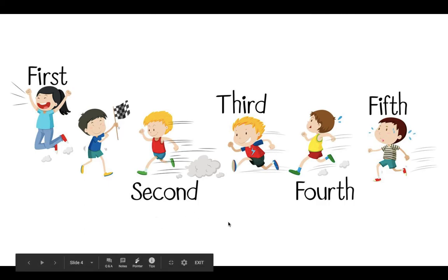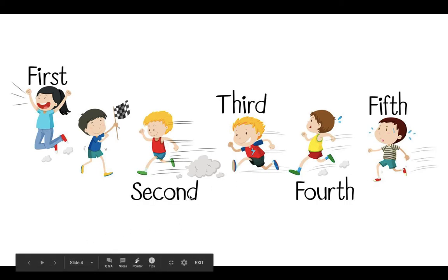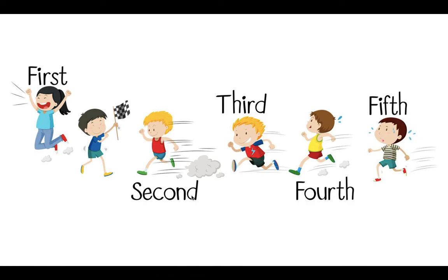Increasingly throughout the time of the race, the people will become further and further spread out, as the more athletic individuals will be farther along with the slower and less athletically inclined individuals behind. This correlates to the HPLC, where as the time increases, the molecules will spread out based on their physical and chemical properties. Lastly, the judges, or those who record the results of the race, record who finishes and the times they finished. This is similar to the detector, which graphs the concentration of the compounds passing through on a chromatogram graph.